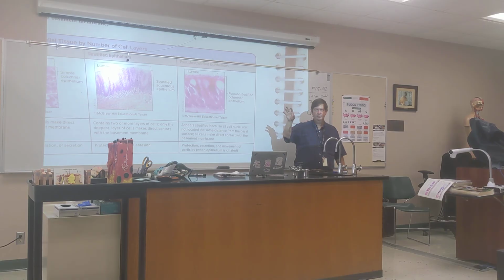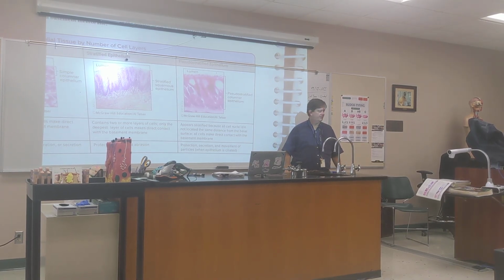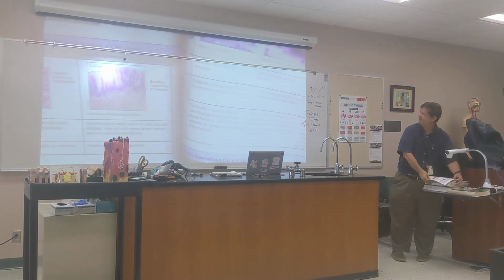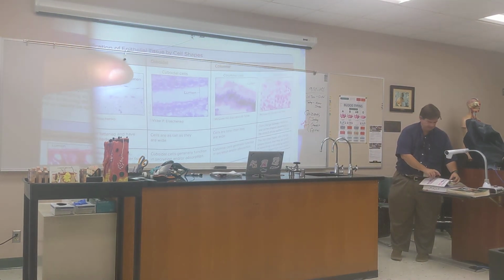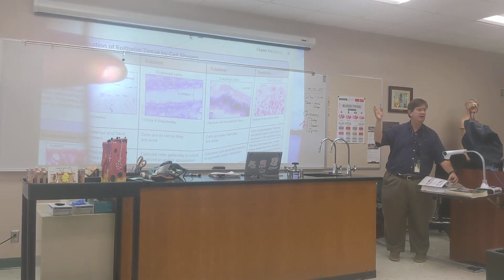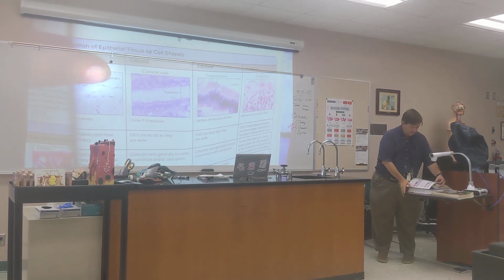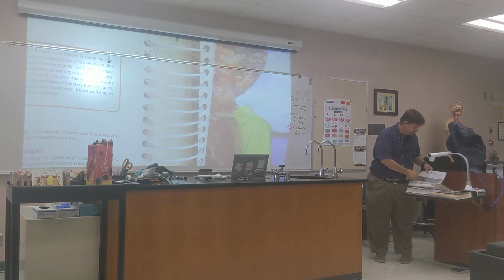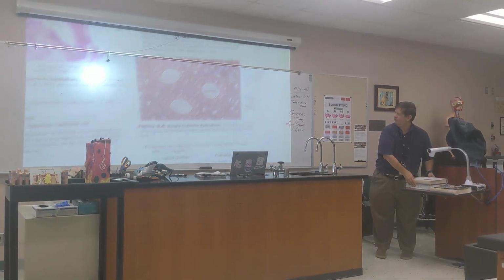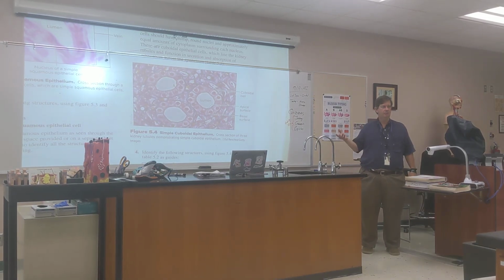Are we good? Where was the location of the simple cuboidal? Oh, okay, thank you. People are pulling me forward and back. I pointed out before, this is a nice picture right here. This is simple cuboidal. I said that is a tubule cut lengthwise. Anybody remember me saying that? I promise I said it, because I'm going to then show you simple cuboidal when you cut across the tube. The wall of the tube is made out of simple cuboidal. That's a kidney tubule. Good?